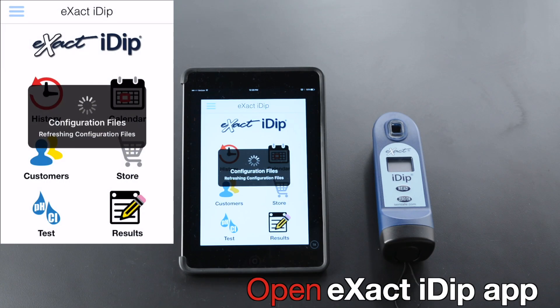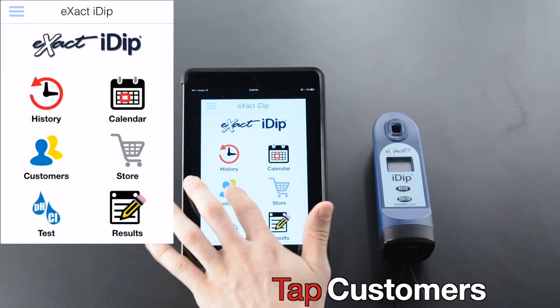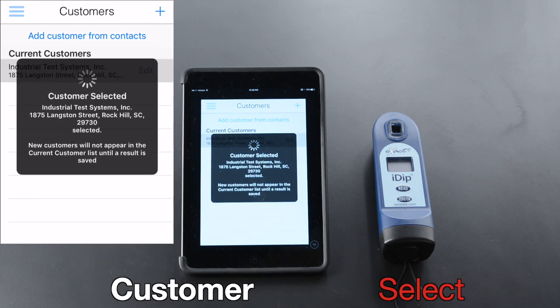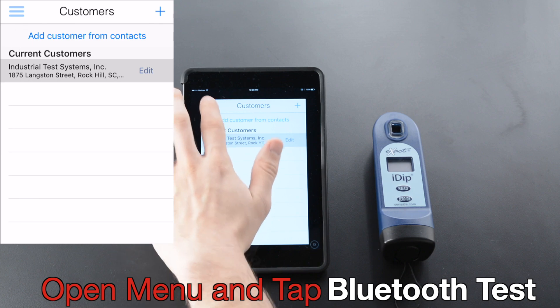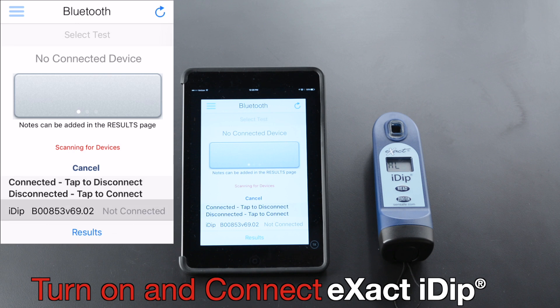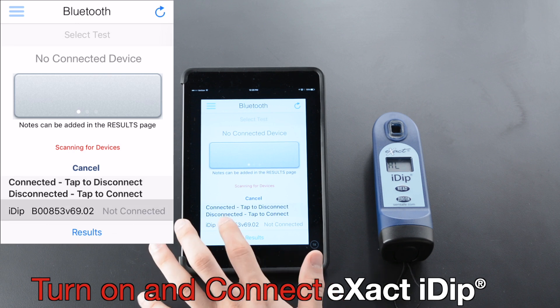Open the Xact iDip app. Tap Customers. Select Customer, open Menu, and tap Bluetooth Test. Turn on and connect Xact iDip.